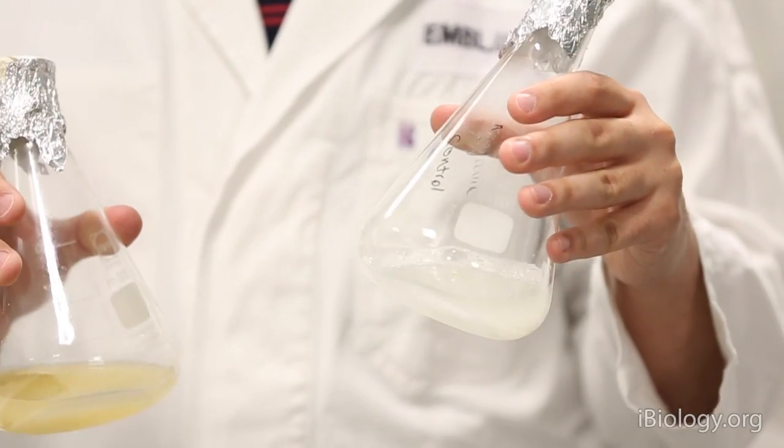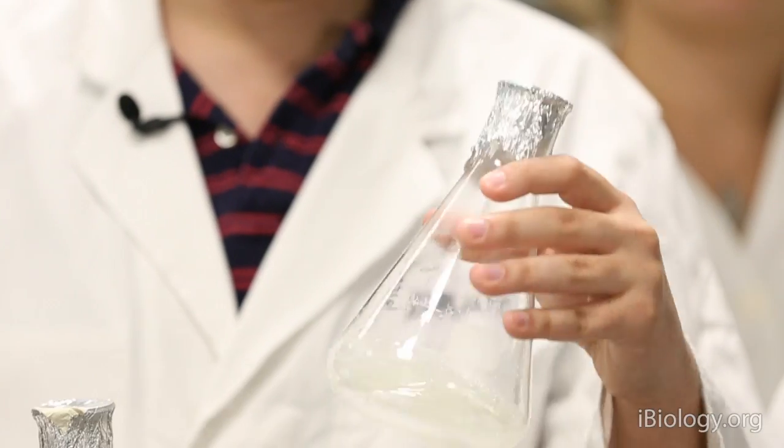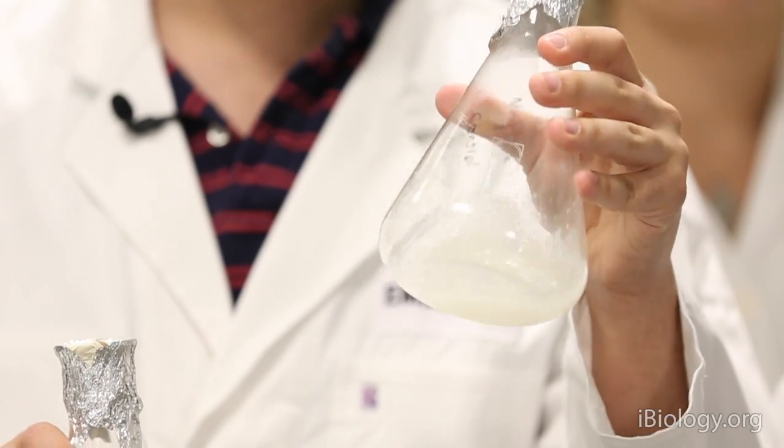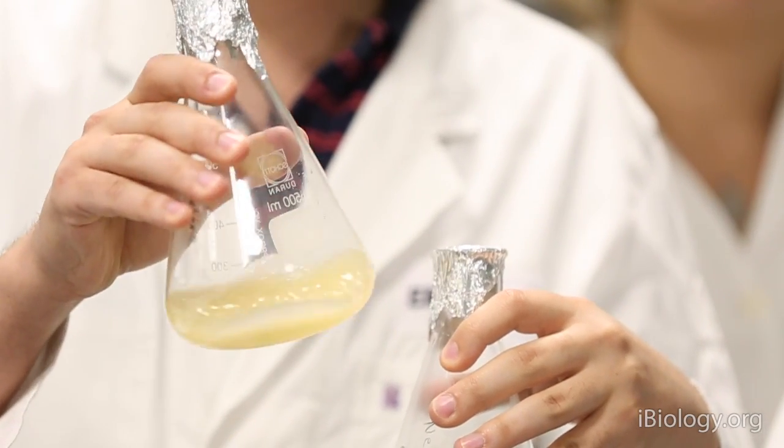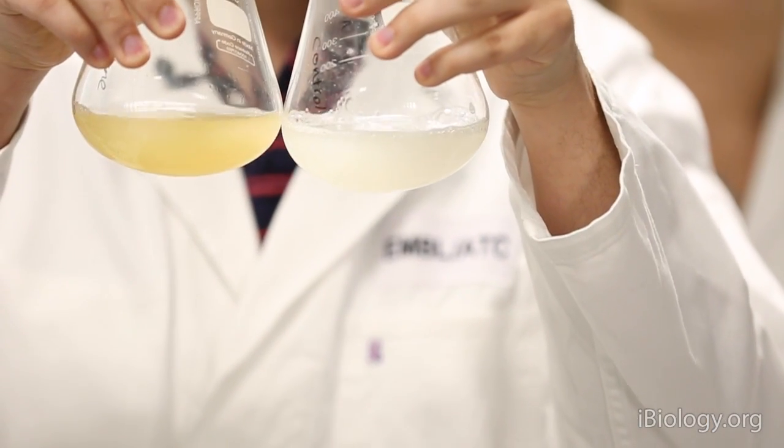As you can clearly see, one of them, our negative control, shows no orange color. That means no carotene is produced. The other one has a clear, bright orange color. That means carotene is produced. This one includes our construct and our plasmid, and therefore our heterologous pathway.